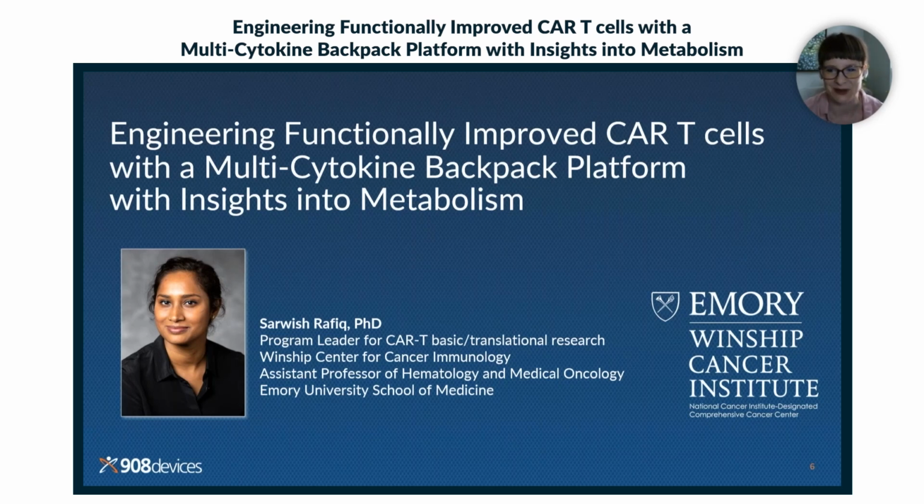Today, we will focus on one of the high-impact projects from the lab, research done on CAR T-cell manufacturing with a multi-cytokine backpack platform and the insights into CAR T-cell metabolism they were able to gain in this work.